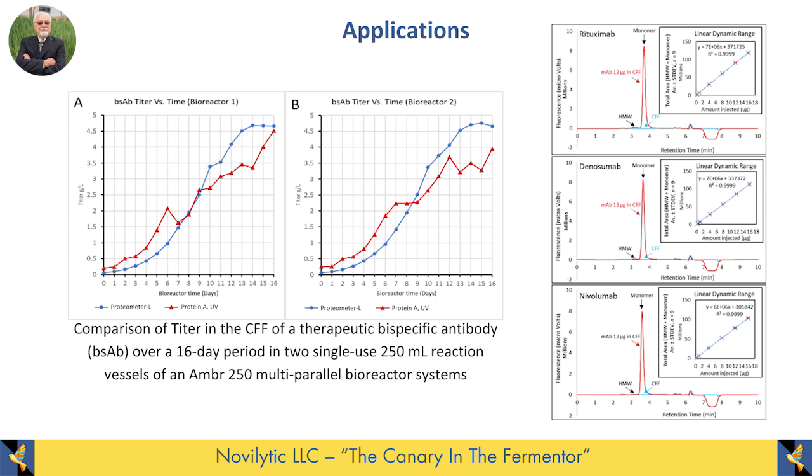And this is two different production runs. And you see how similar they are. They're not identical, but you wouldn't expect them to be identical. And this is an alternative method to do it in the red. So the blue is with our molecular recognition assay. The red is with another way.